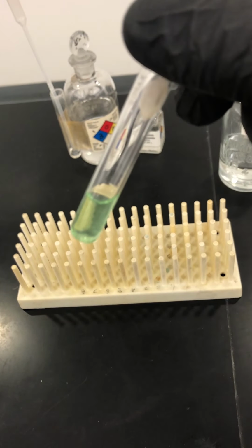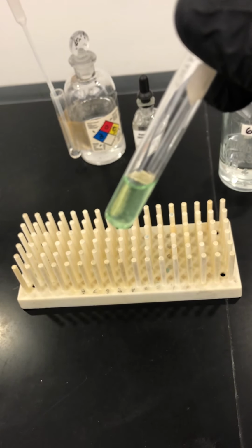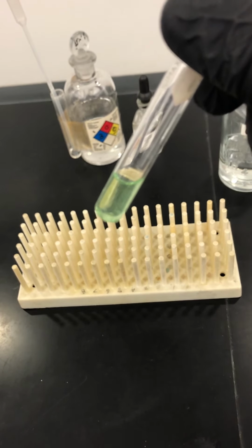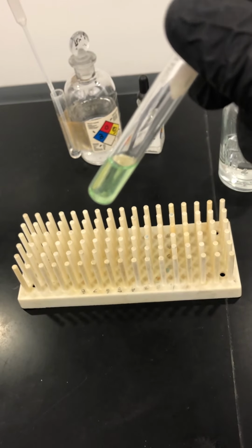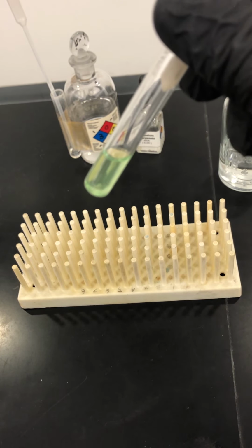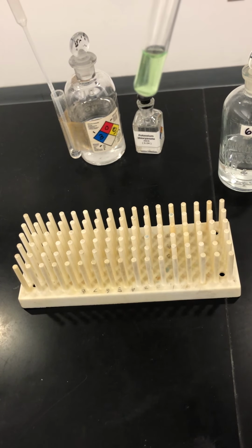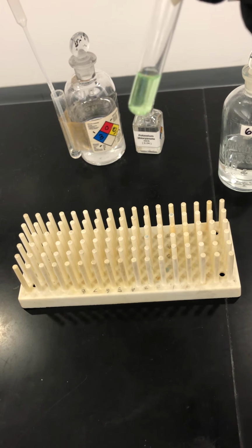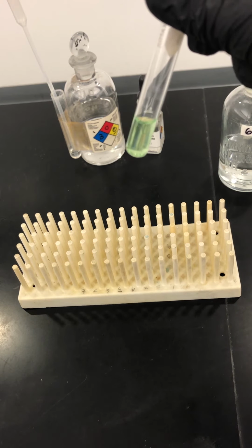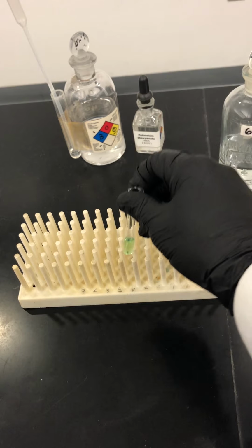Okay, here is my supernatant. I had that copper 2 sulfide pellet that I redissolved in nitric acid and heated. But after a while, there was still some solid residue, so I spun it and I decanted it into a fresh tube. And you see the aqua blue, kind of greenish color that indicates the presence of copper 2 ions. But to confirm it, we're going to use another test, which is to add ammonia. And similar to silver, copper 2 ions also form a complex with ammonia. But let's see what we observe here.